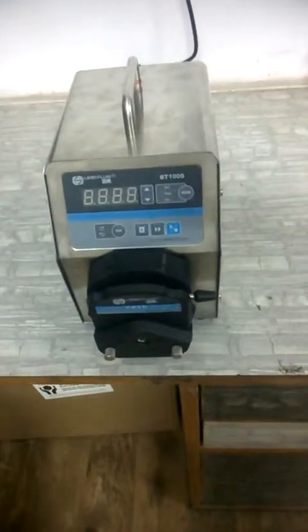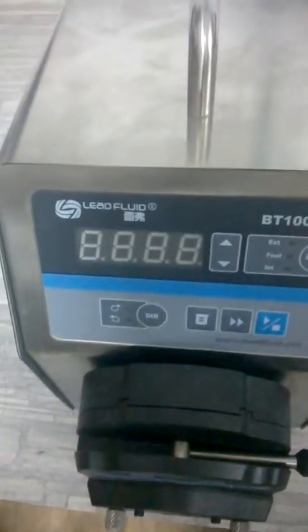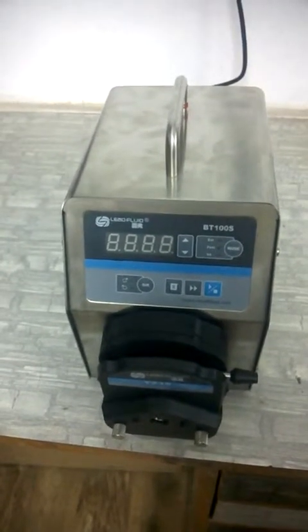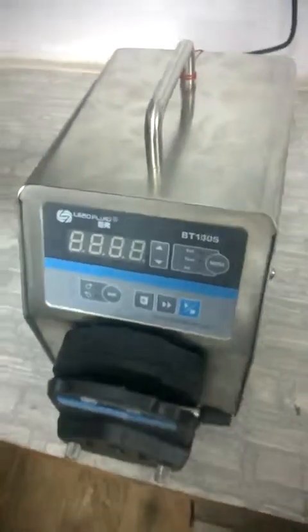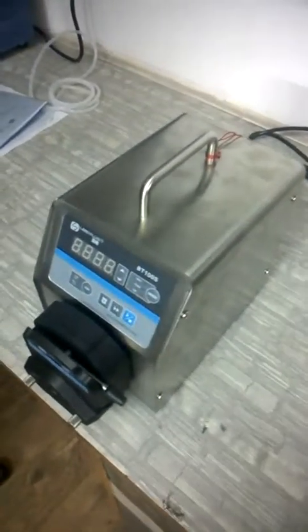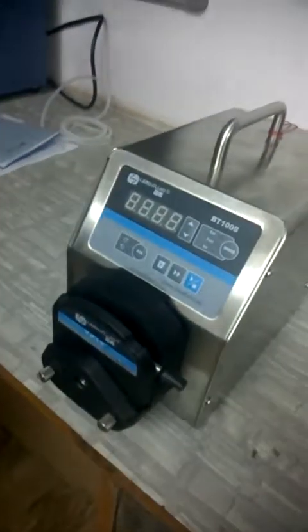Dear customer, we thank you for purchasing the Lead Fluid peristaltic pump. Unigenetics is distributing these pumps in India for the last 6 to 8 months. This is a very simple plug-and-play machine, but we are demonstrating how to operate the machine once you receive it.